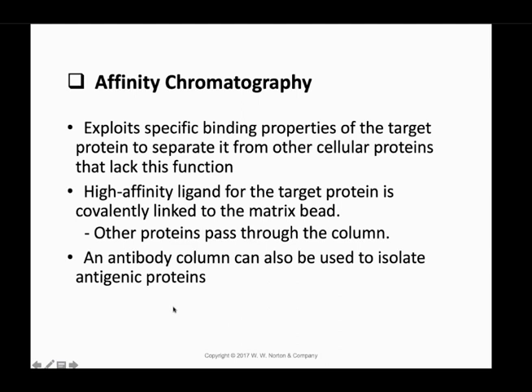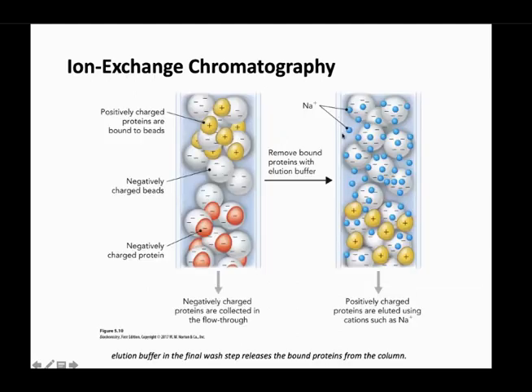Professor, I'm sorry, do you mind going back to the one where you use the buffer? I'm just a little confused. How does the buffer help separate the positive and the negative? Are you clear with this first part? Yes. Okay, so imagine you put the mix, right? All the positive proteins are going to bind to the beads. They're bound to the beads, and then how are you going to get the proteins from the beads? You need a buffer, something to detach the protein that you want, because you want to study the proteins, right?